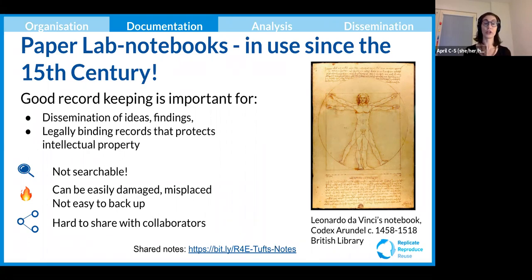Keep track of the work you're doing. And if you're using a paper notebook, think about whether it would be easier if you were able to search through the materials that you're writing down in your research, whether you have a way to back up those materials in case there's a fire or something happens to your lab notebook, and whether there is an easy way for you to share and collaborate on that work when it is documented in just the hard copy version.